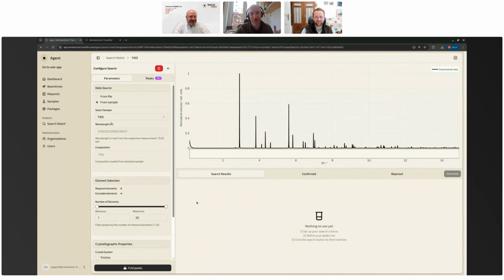I'm not 100% sure, but sometimes the COD has glaring omissions that are surprising. But I would imagine that you can probably find a few of the ingredients in COD. But you have to test it out. So send us a sample that you want to work with. Or if you already have some data, I'll show you how you can upload it and test it out directly.